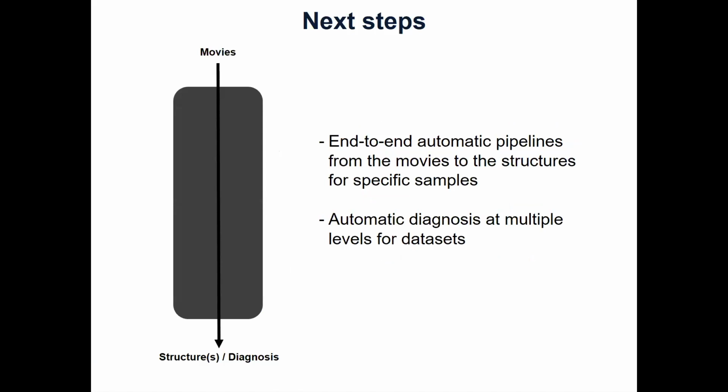So this will be an end-to-end pipeline, but for some specific proteins, based on you sort of knowing what to expect from this data set. Can we just develop an end-to-end pipeline that can automatically solve structures?